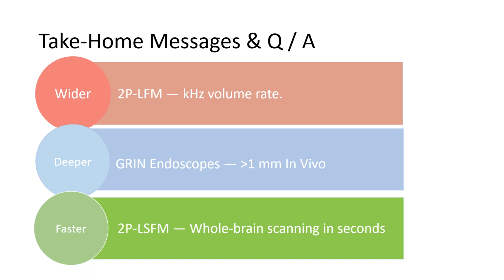Photon counting turns the same platform into a biochemical analyzer, and careful control of pulse parameters and polarization keeps our sample alive. Open-source hardware, red-shifted probes, and AI reconstruction stand ready to democratize and extend those tools.